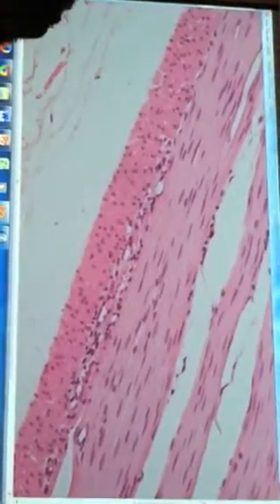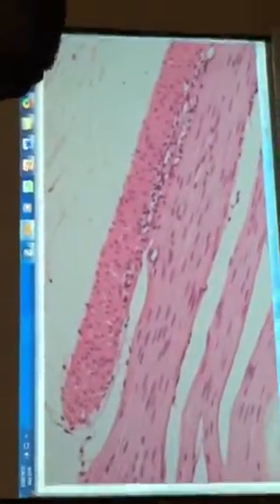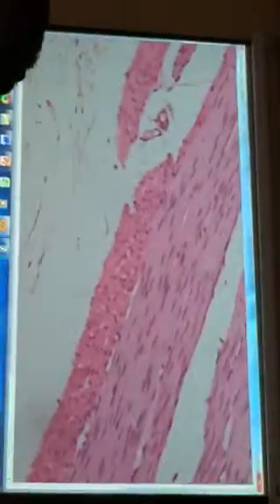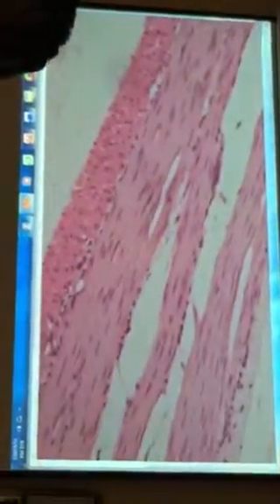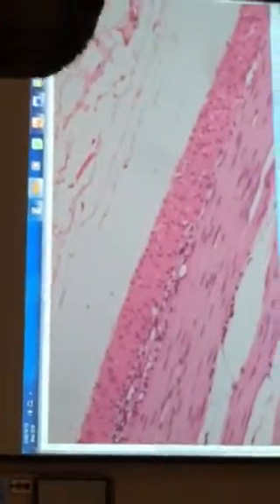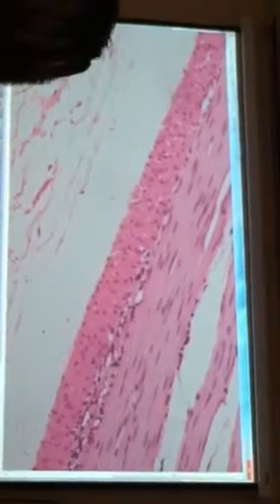Actually, this is not on your list, but this is part of the myenteric plexus right here. That nerve plexus innervates that. Okay, and then the little itty bitty serosa, I see just a little wispy bit of it. I don't know if I'm making it up or not. It's really thin. It's just a simple epithelial layer with a teeny bit of connective tissue. But it's really not a very good example. It should be just a teeny bit thicker than what's on the edge here.